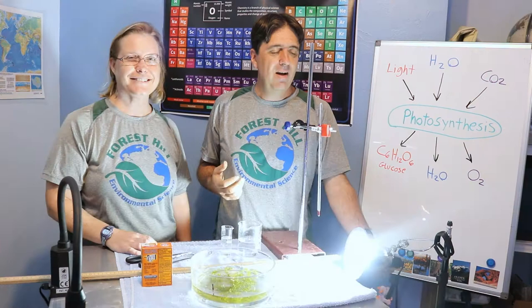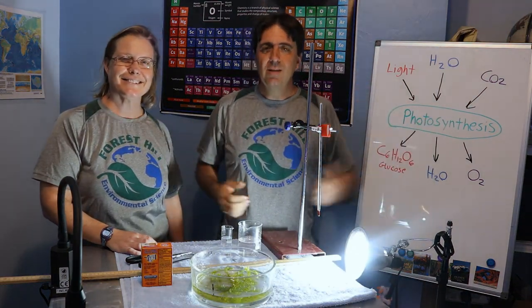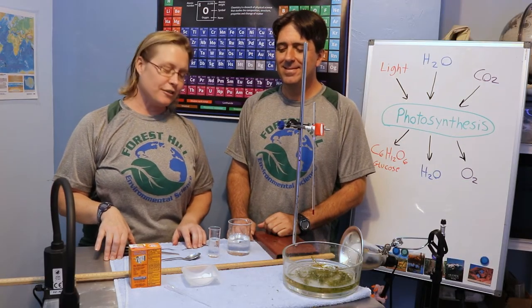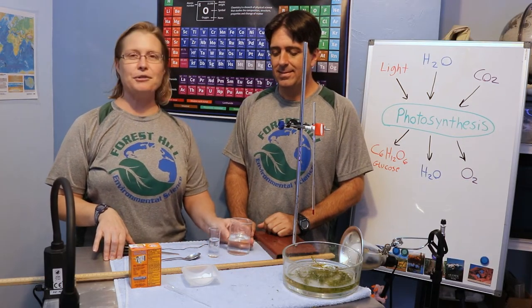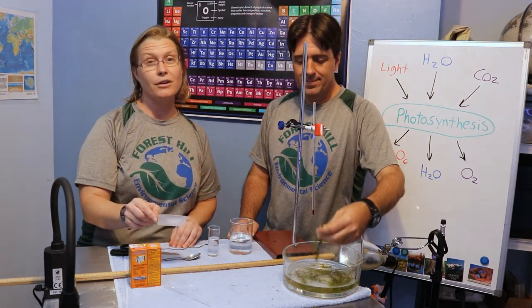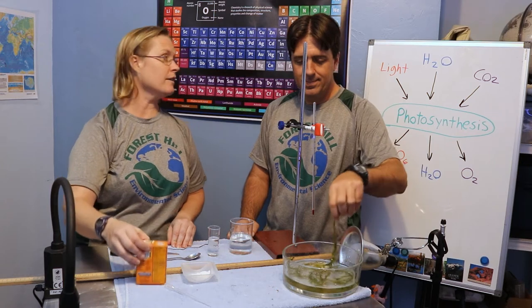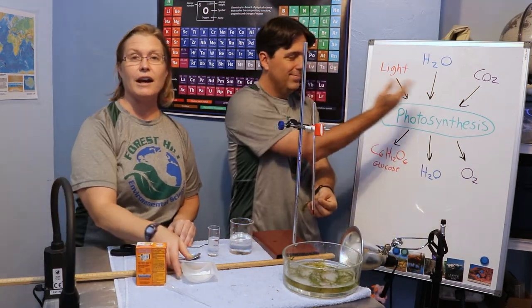We're going to use this LED light as our light source today and set up the experiment. The first part has to do with our setup: we start with a 200 milliliter beaker with about 125 milliliters of RO water, a 50 milliliter beaker with about 35 milliliters of RO water, and then we also have a gram of baking soda. This gram of baking soda is going to provide the CO₂ needed for the reaction to take place.